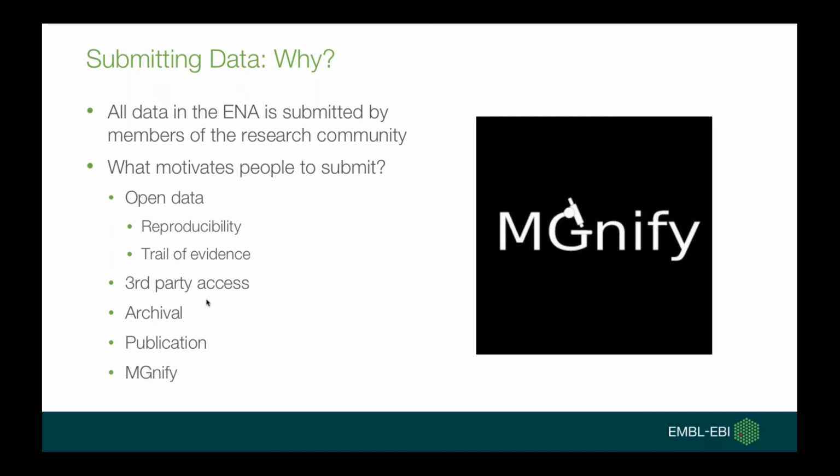There are also more practical reasons why it's useful. Uploading your data to a public archive makes it accessible to third parties, so it can be helpful to share with perhaps collaborators who are geographically remote from you. It's useful for archival. If you're a relatively small sequencing center, then the overheads of storing lots of bulky sequence files can become quite a problem. But if you submit it to a database like ENA, then it is going to be archived in perpetuity, and you don't necessarily need to keep your own local copies.